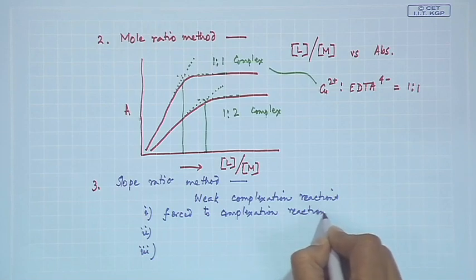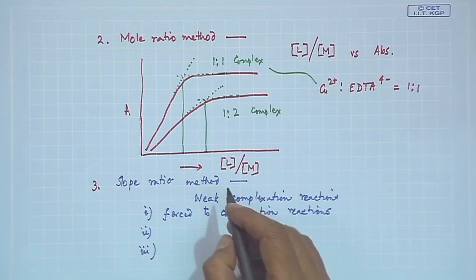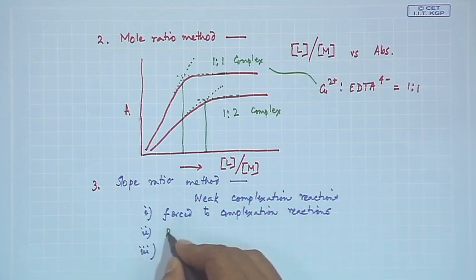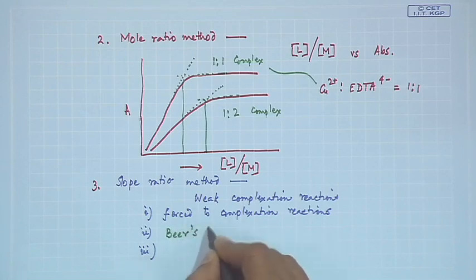And that is what we want to monitor. In this particular case, we should also have the corresponding follow-up of Beer's law.